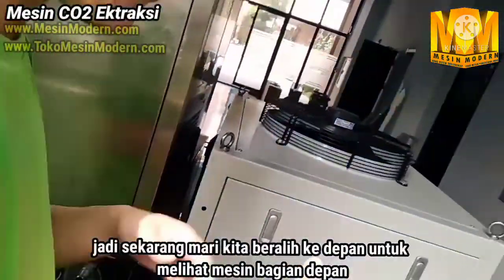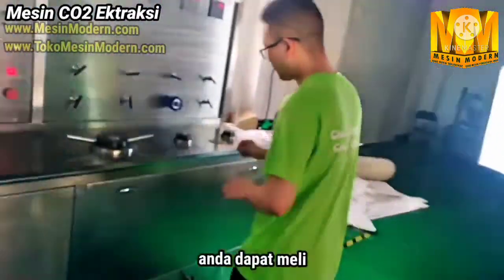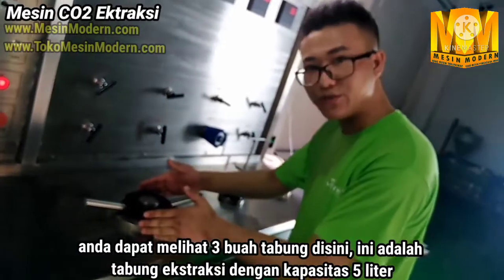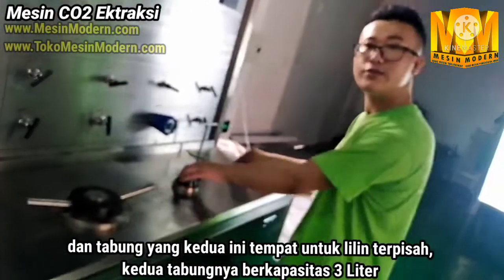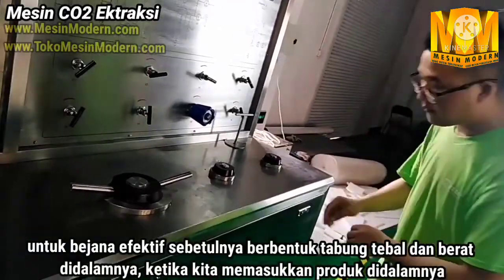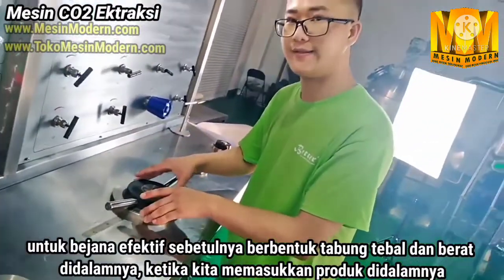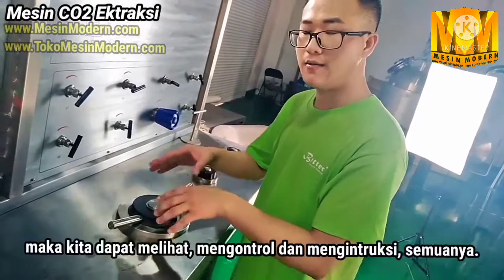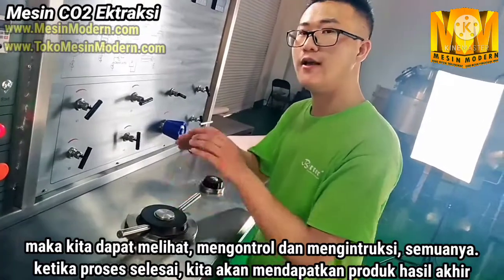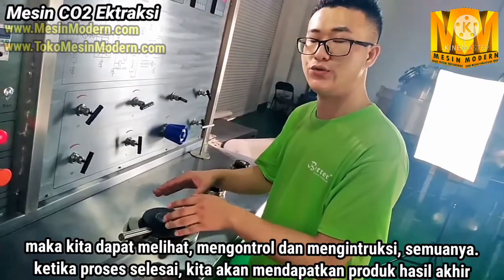Now let's go to the front of the machine. You can see there are three vessels here. This is the extraction vessel — it's five liters. And these two are the separation vessels — both are three liters capacity. For the extraction vessel, there is a biomass canister inside. When we put the biomass into the canister, then we put the canister into the extraction vessel and we can do the extraction. When the extraction finishes, we take the canister out to discharge the spent biomass.